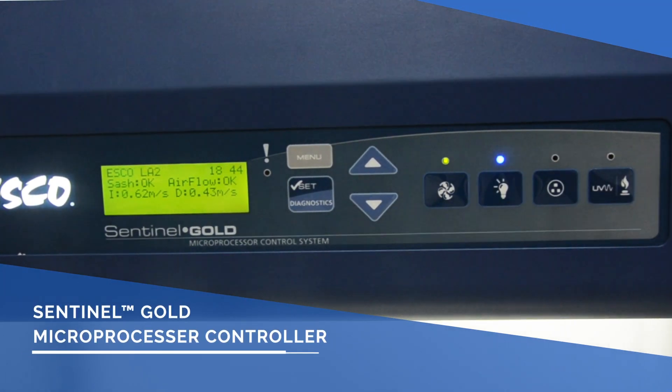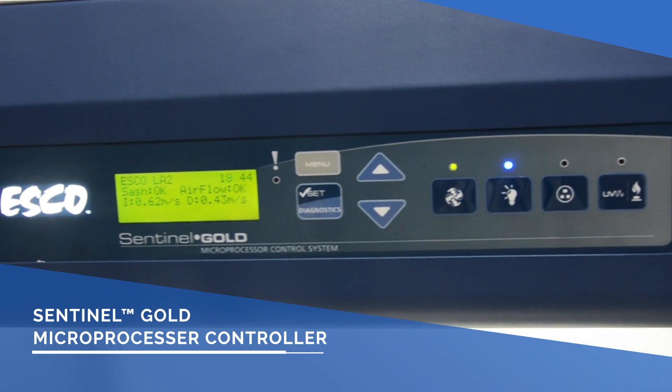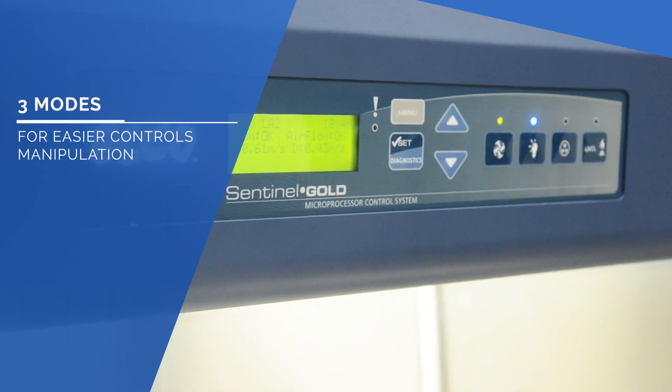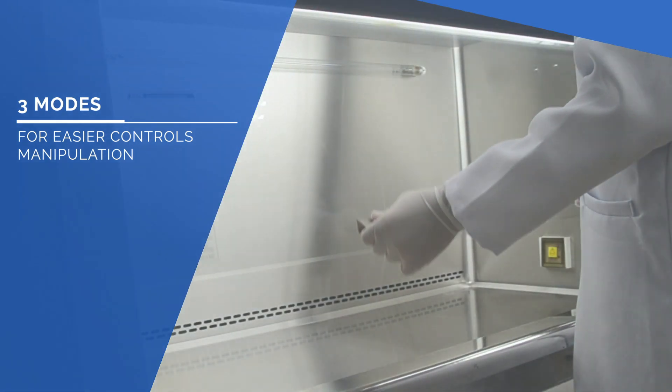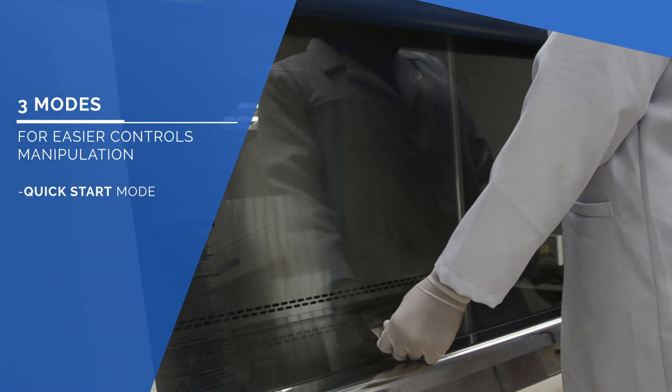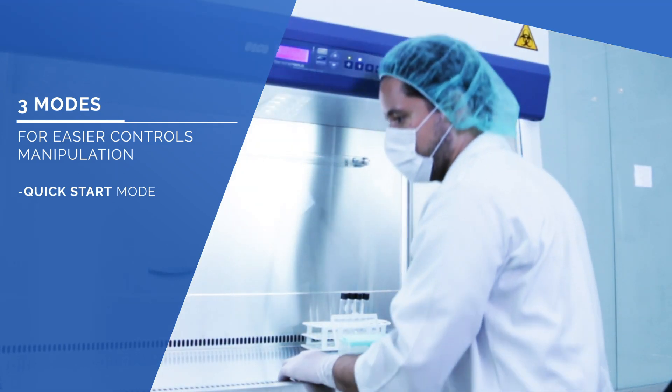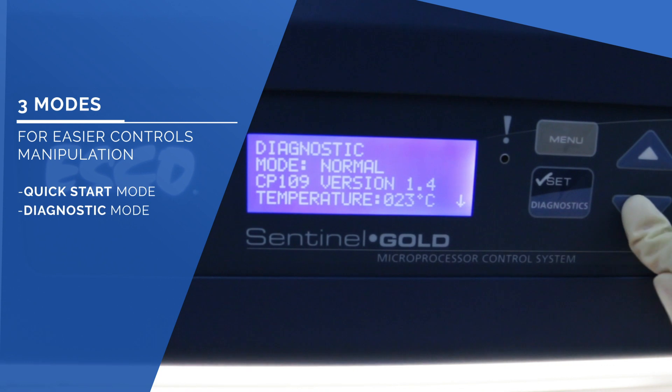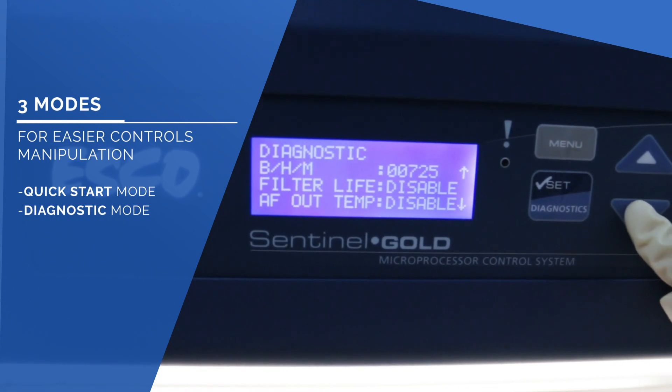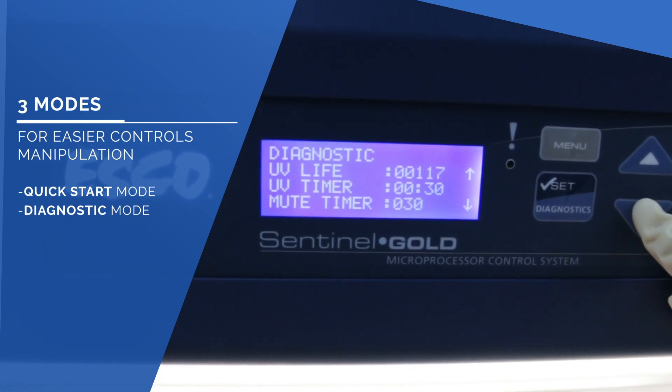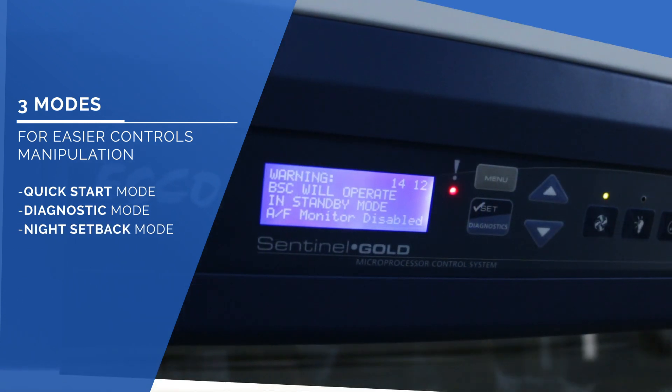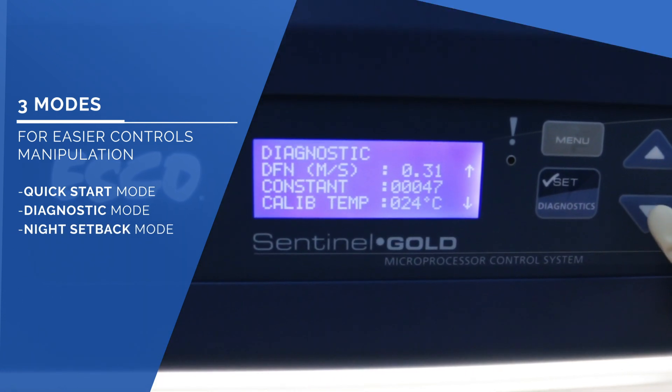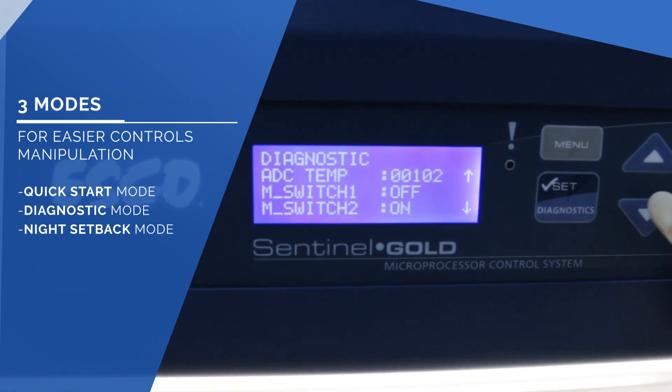The Sentinel Gold Microprocessor Controller comprehensively displays all safety information in one screen. Quick Start Mode allows automatic turning on of the fan and fluorescent lamp when the sash is raised to its working height. Diagnostic Mode for easy checking of the cabinet's operating parameters and assist servicing. Night Setback Mode can provide maintained containment even at energy-saving mode with the fan running at half speed.